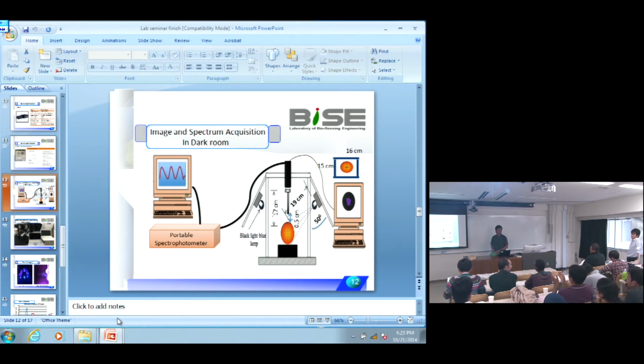Why do you use the UVA light? Well, last time I was trying two types of light. What are the basis to use the UVA light? UV light is a type of light that can be used to make a fluorescence phenomenon. So this type of light is usually used to get the fluorescence phenomenon. Is that your question?